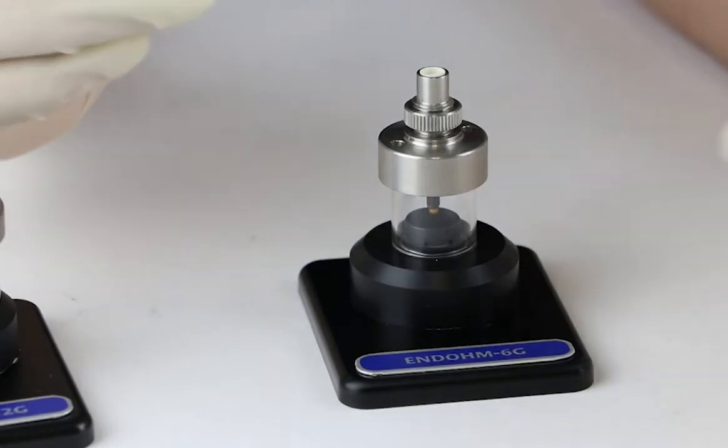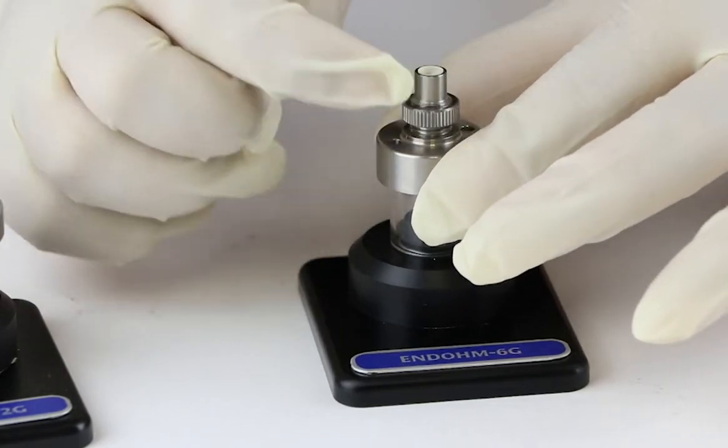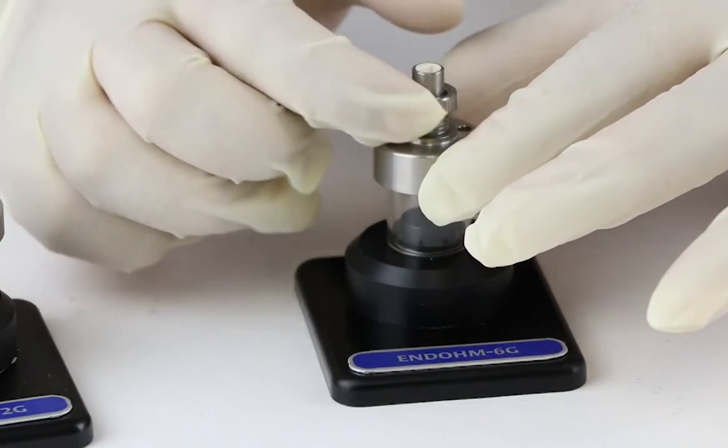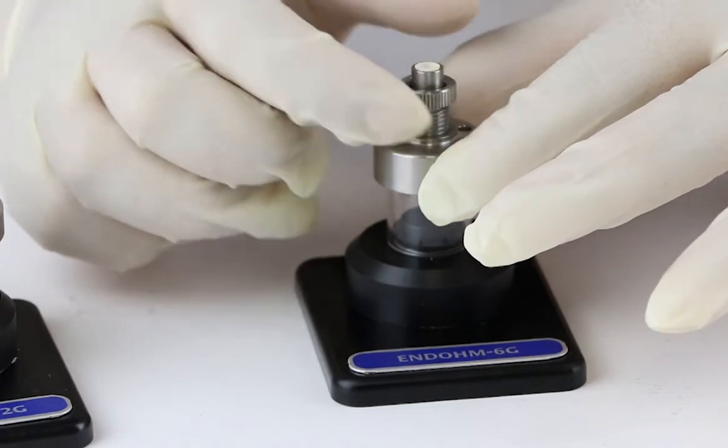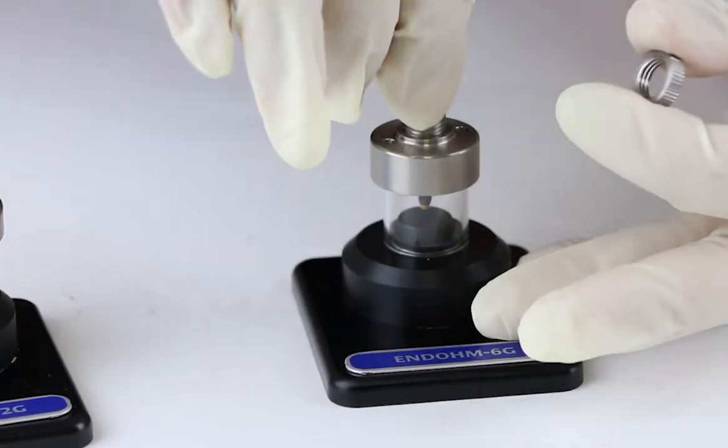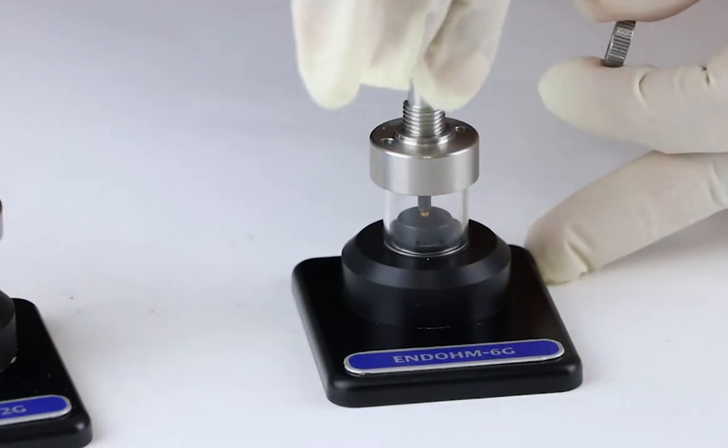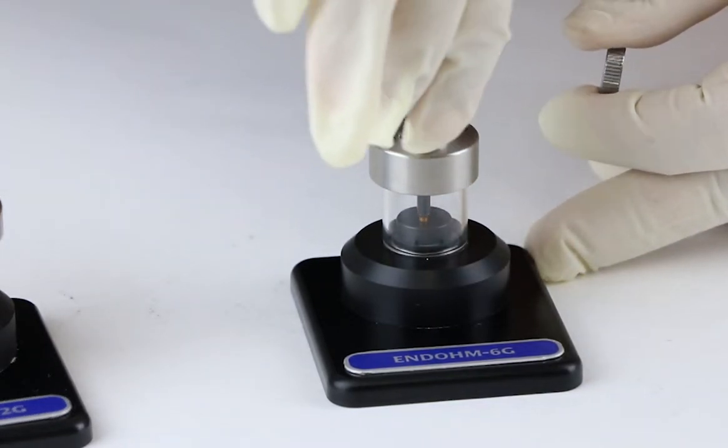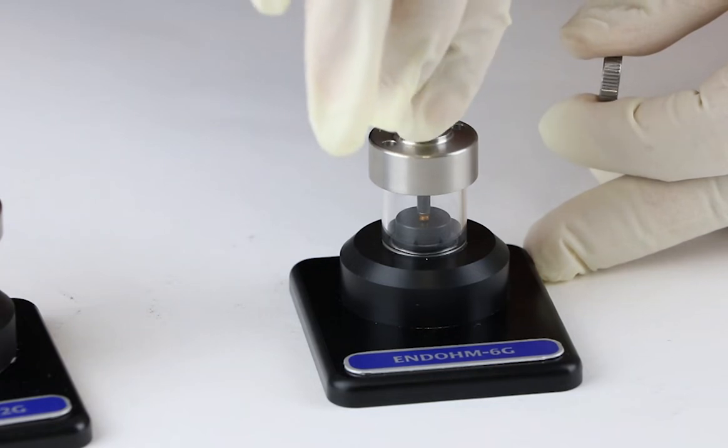First, untighten the big ring on the top of the cap to loosen the top electrode. Then, turn the top electrode clockwise to move towards the bottom electrode, or turn anti-clockwise to move away from the bottom electrode.